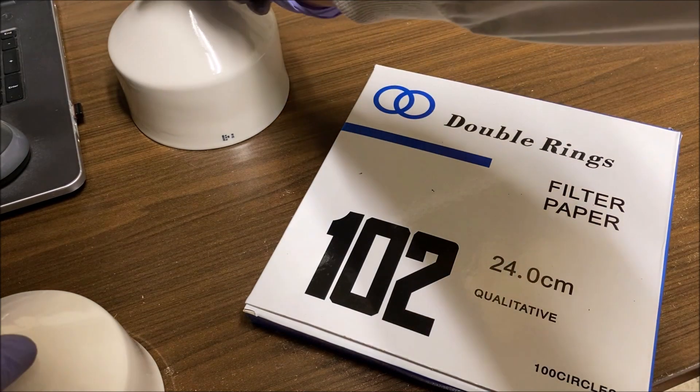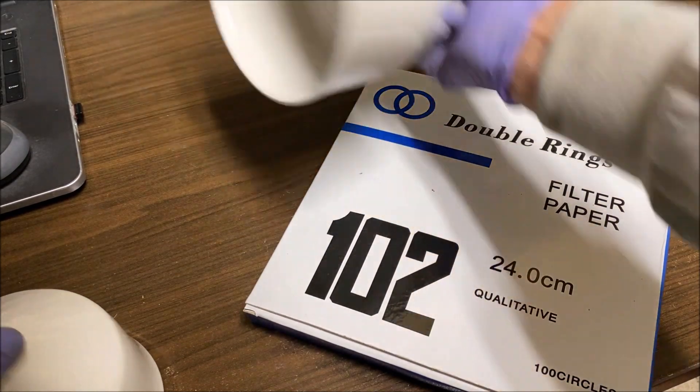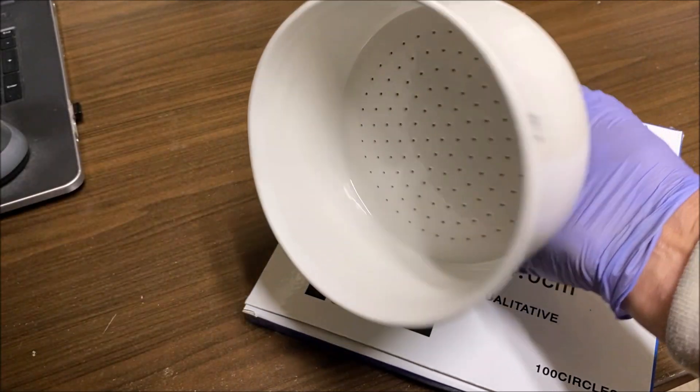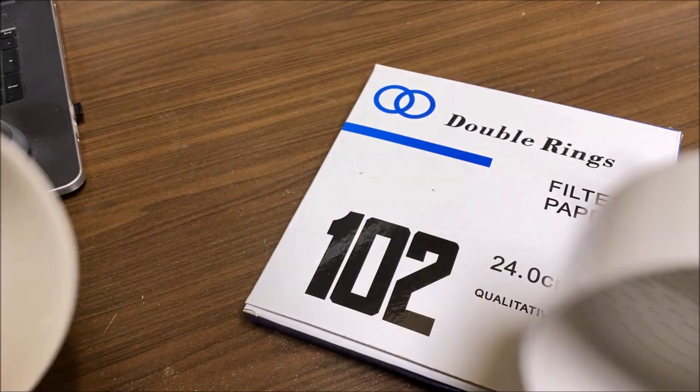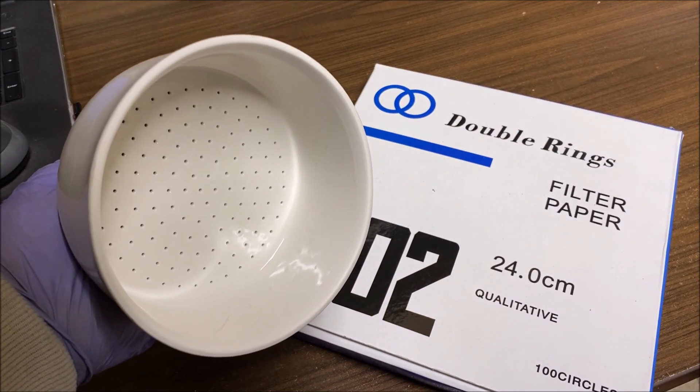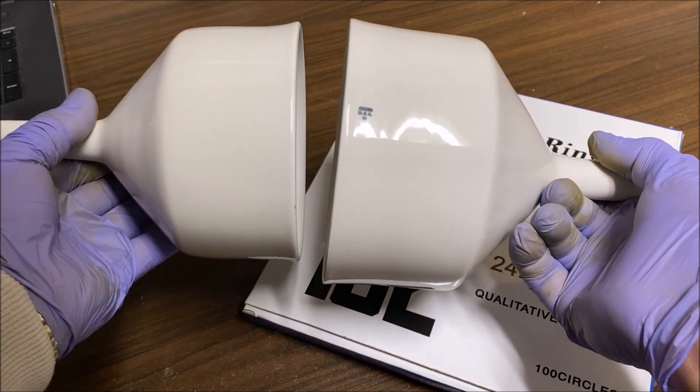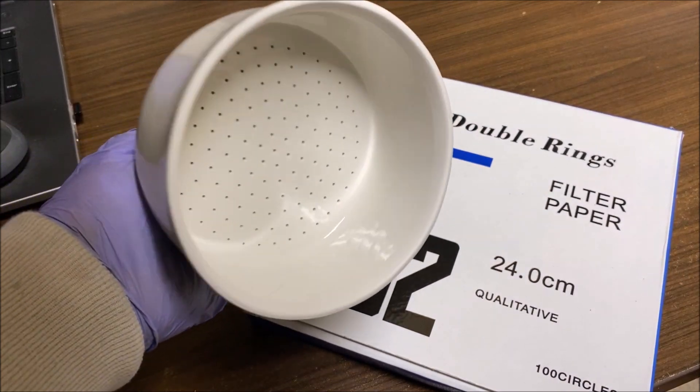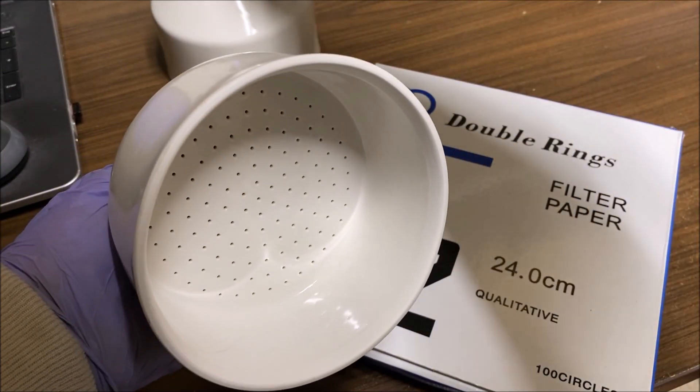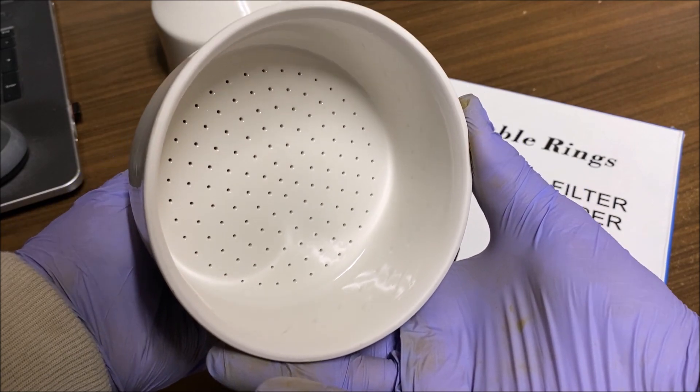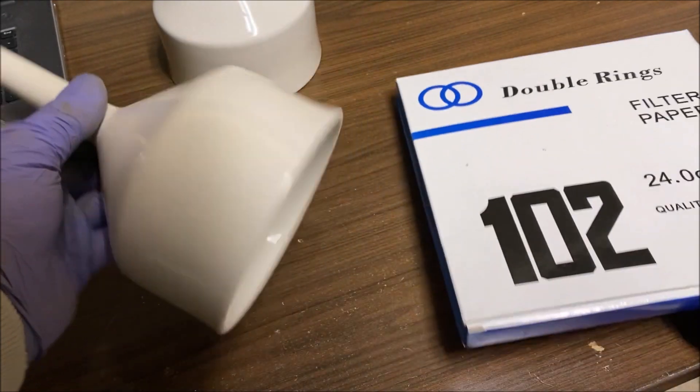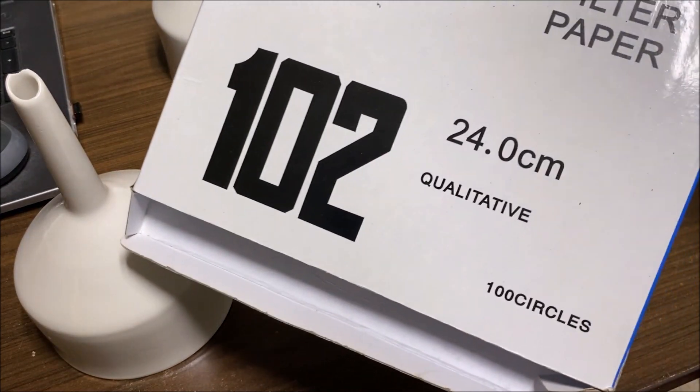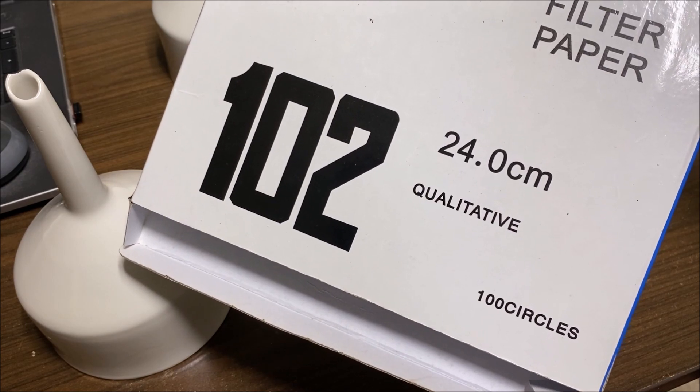One of my viewers asked how I made these filters to fit down in these funnels. I've got a 12.5 centimeter funnel here, and this is an 11 centimeter funnel that fits down in here perfectly. So what we're going to do is use the 11 centimeter funnel as a pattern to make our special filter. These are 24 centimeter filter papers.